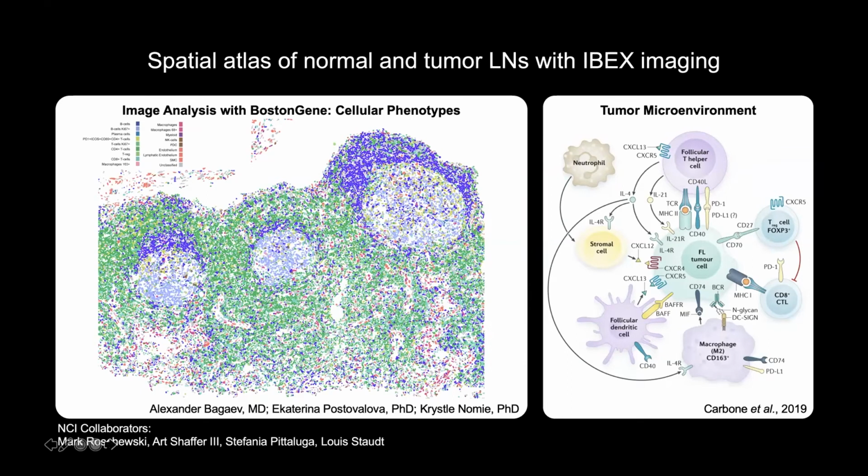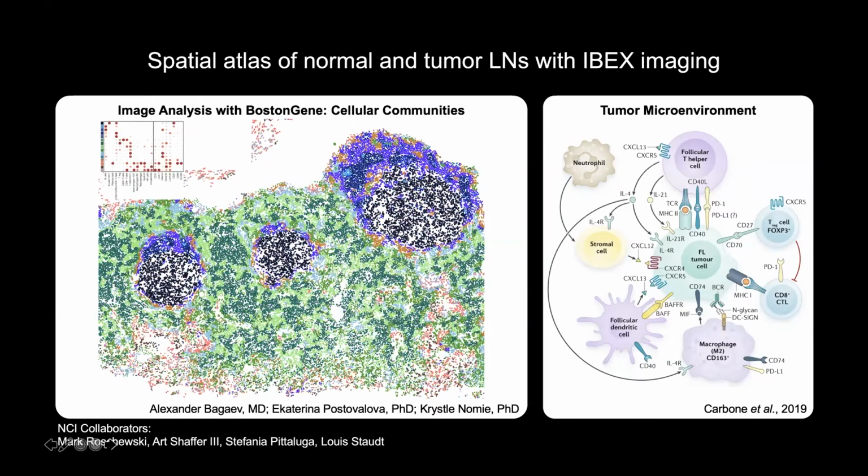And then again, expanding on the work by many of the pioneers on HuBMAP, these community-based analyses. So implementing those workflows where we know that it's not enough just to have the cells, we want to find their neighbors. And I think it's really wild because you see unique little pockets of green, which correspond to an enrichment for certain populations of T cells. We see a really nice germinal center in black and different areas of anatomical structures and niches here. And then, yeah, that's it.